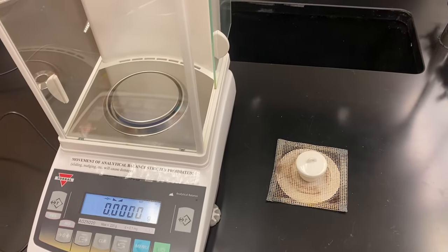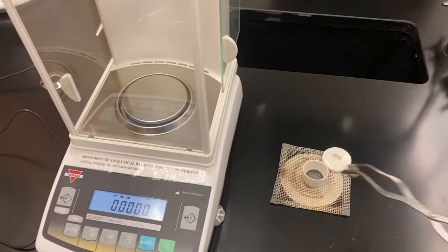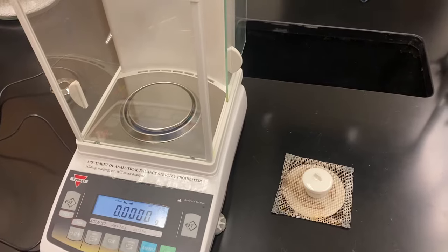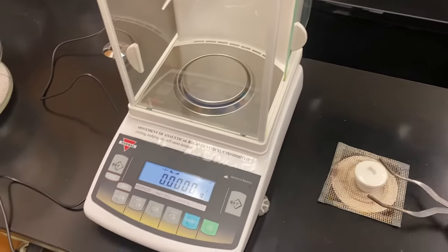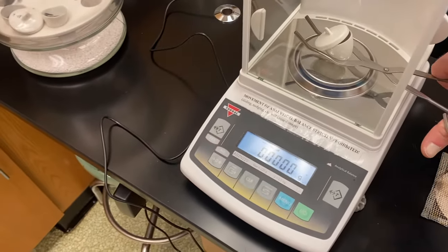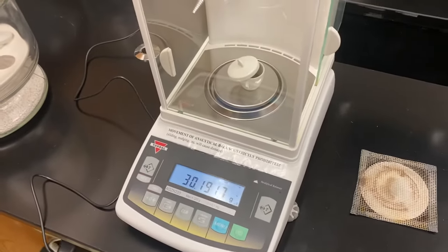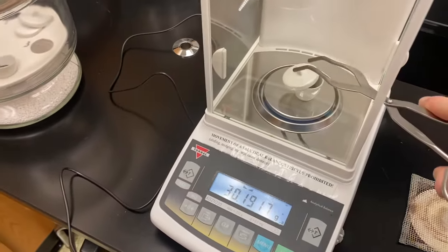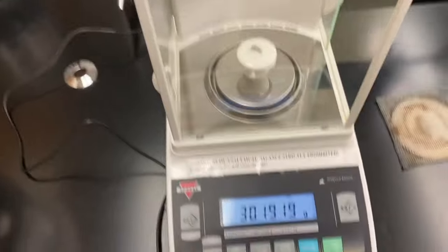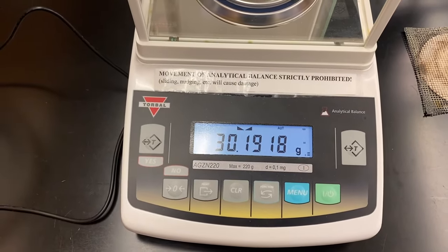Now I can add my magnesium to my crucible. I'm going to open up the crucible, add my coiled magnesium in, replace the lid, and then again take the mass. Very gently pick it up, and then we can record the mass. There's our final mass.